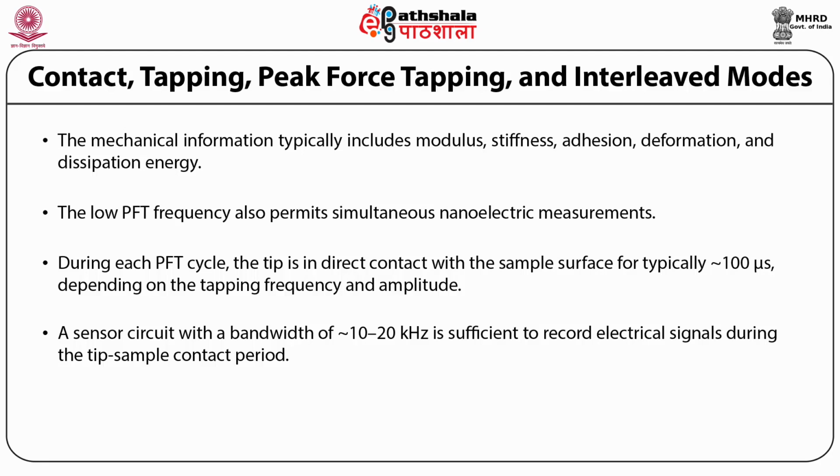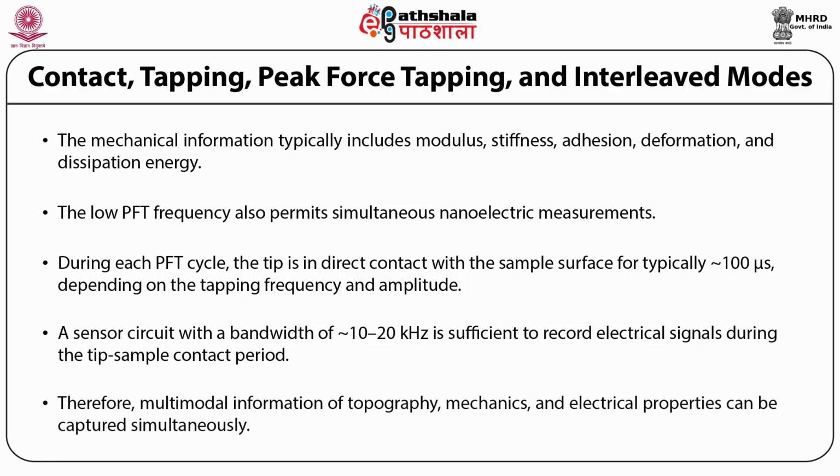A sensor circuit with a bandwidth of nearly 10 to 20 kHz is sufficient to record the electrical signal during the tip-sample contact period. Therefore, multimodal information of topography, mechanics, and electrical properties can be captured simultaneously.